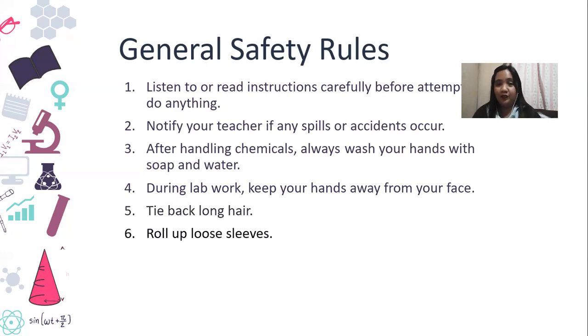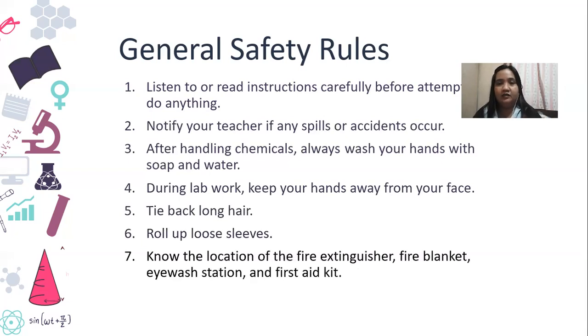So roll up loose sleeves. I don't think this will be a problem since our uniform would be short sleeves, but in case in the future you might be assigned in a laboratory and you have to wear long sleeves, please make sure that before doing the experiment you roll up your sleeves. And then, of course, this is a must. Actually, I feel that this should be one of the first few things that you have to know.